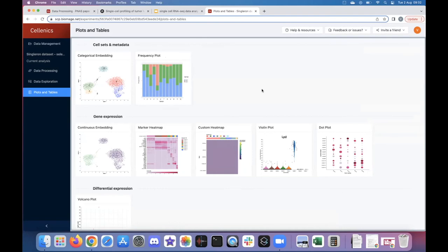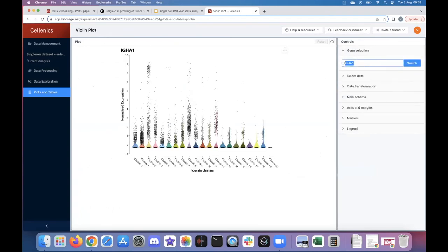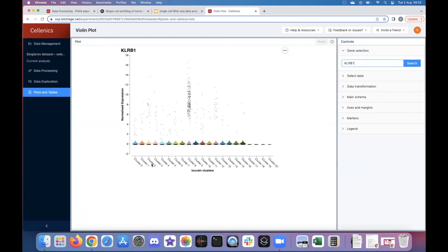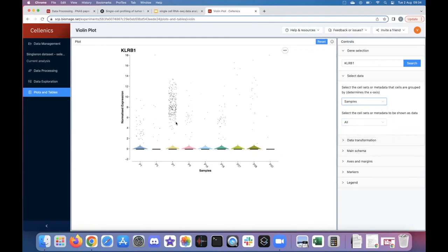What we can see confirms a finding from the paper: there is quite a difference in the proportion of T-cells across different samples, and specifically sample P7 has a very high proportion of T-cells compared to all others — something the authors commented on and wanted to follow up. The paper also reported identification of rare cell populations including Th17-like cells, identified using markers including KLRB1. The violin plot shows expression of KLRB1 across all clusters, and when we look at our custom cell sets we see indeed a reasonable amount of KLRB1 expression within the T-cell population.